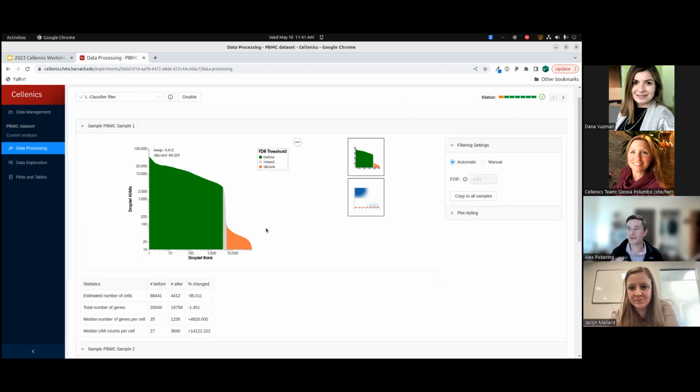Oh, yeah. No worries, Jacqueline. Good point for me to make. So this data set that I'm looking at here is not the workshop data set. I'm just showing you guys an example data set, just to give you a demo of the data processing. So this has already happened on the data set that we're looking at. Yeah, and the COVID-19 data set is not this one, and it'll look different than the one I'm looking at. Okay.